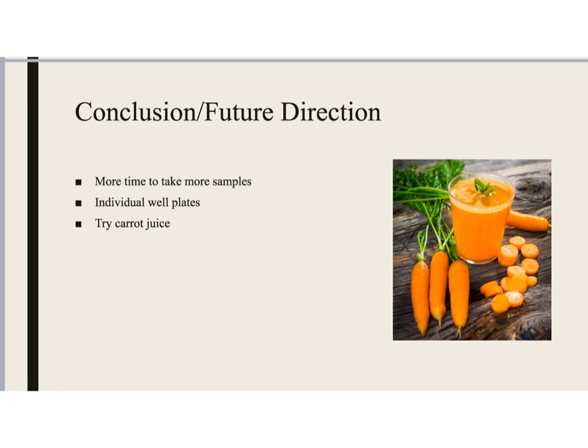Also, this just helps with contamination so that the moving back and forth from the incubator to the hood might not cause something to go wrong with my cells.